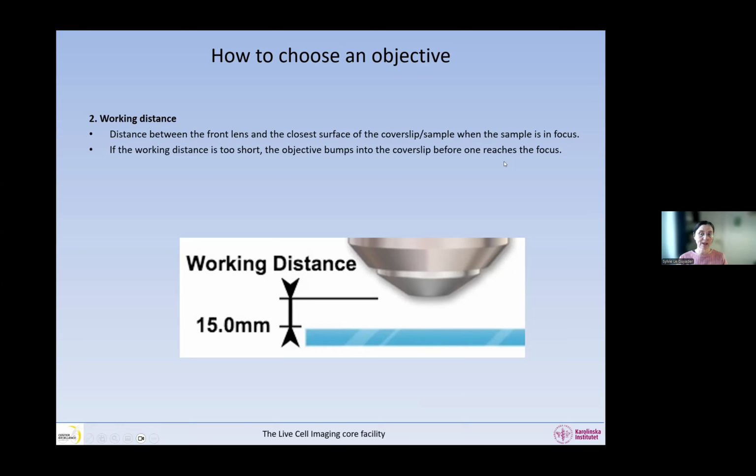If this happens sometimes to you, that one day you come to your microscope and try to focus on your sample. Your sample is set up in the normal way. It's a slide maybe with a cover slip, and you try to focus on it and it's like, I can't focus. I just keep trying and it doesn't work. And then suddenly your sample starts moving in XY. If your sample starts moving from right to left, you know that you're moving it, so you're pushing on the sample. If you push on the sample clearly and you're still not in focus, there's a problem.